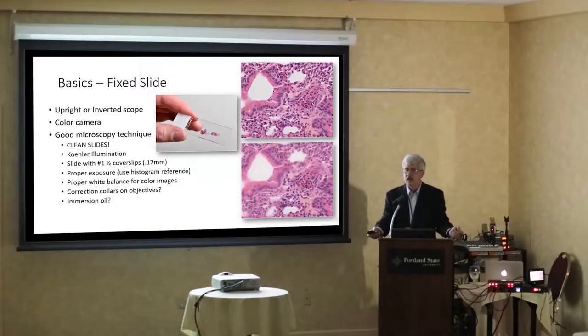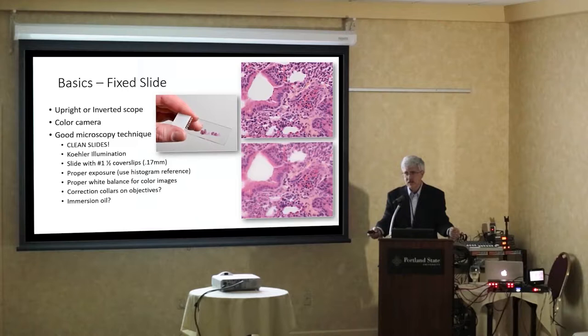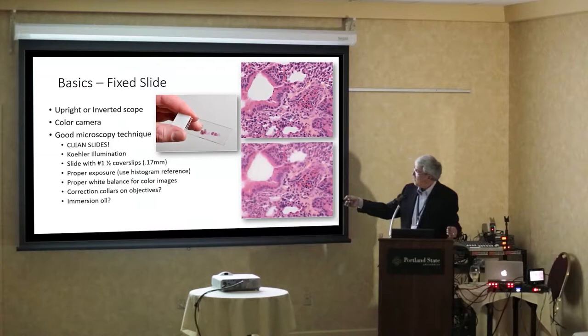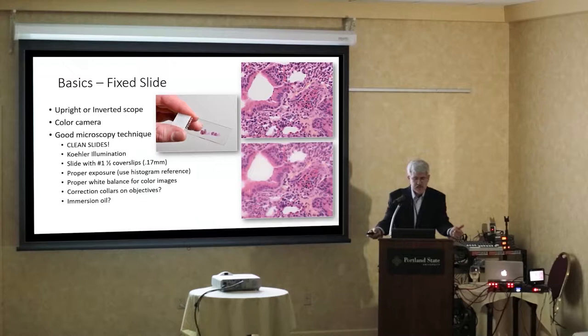Coverslips — even if you don't coverslip your own slides, coverslips come in a variety of flavors: number ones, one-and-a-halves, and twos. Number one-and-a-halves are 0.17 mm thick; number twos are 0.22 mm. If you're doing high magnification without a correction collar, you'll get fuzzy blurry pictures because the lenses are corrected for 0.17, not 0.22. The correction collar can correct for that. Are you using oil? Are you doing your white balance properly? Proper exposure? These are just the beginning of the multidimensional process.